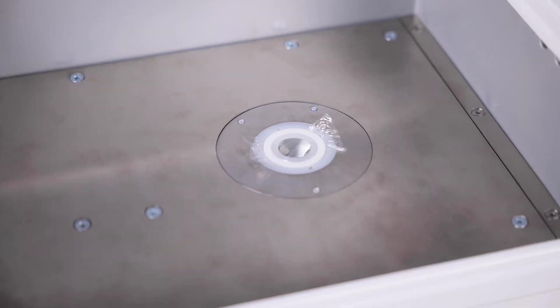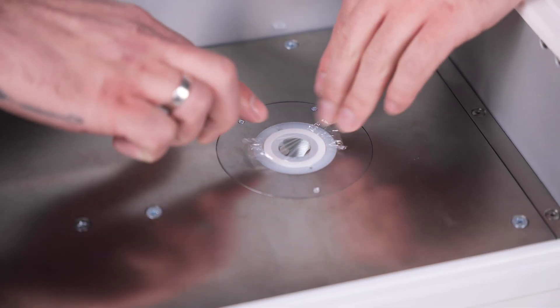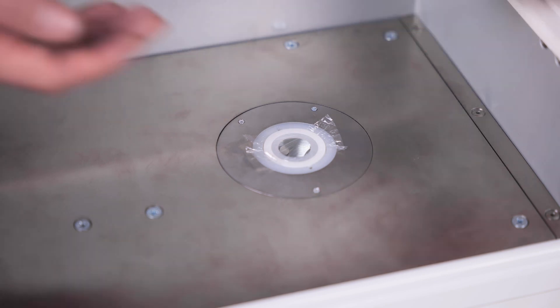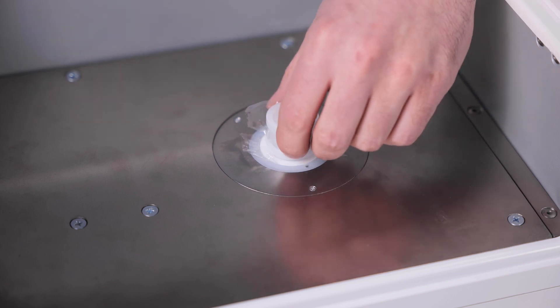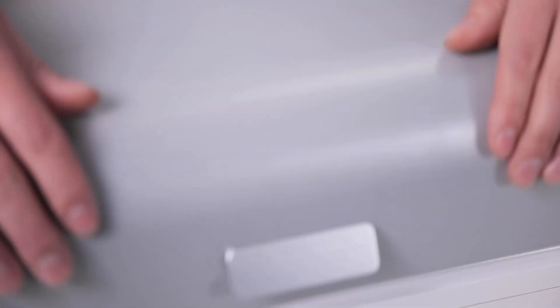When operating benchtop spectrometers, make sure that the protective film is not damaged at all times. Use special cuvettes for liquid or bulk samples to avoid getting samples on the detector or x-ray tube.